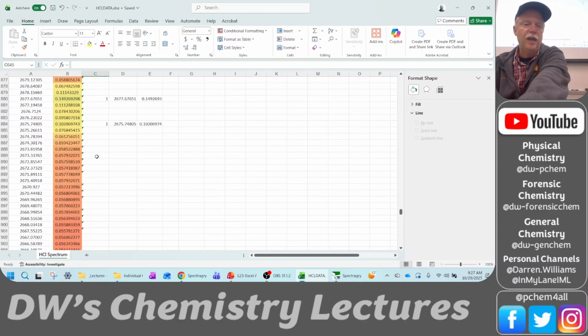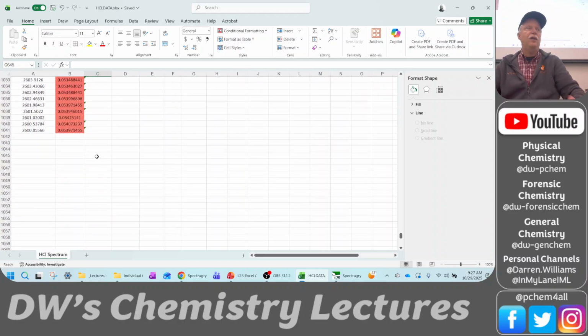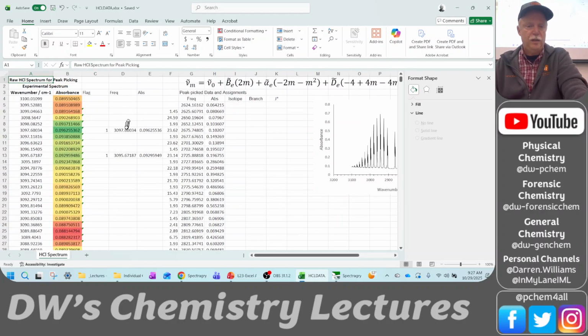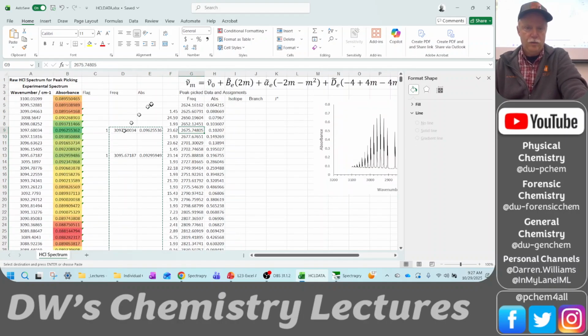See, I'm just scrolling down. I'm not seeing any more. I think this is the area we cleaned up before. Okay, so I think we have it all. We don't have any noise peaks anymore. So let's go back to the top. Let's recopy these things. Come over here and we'll paste them right here.